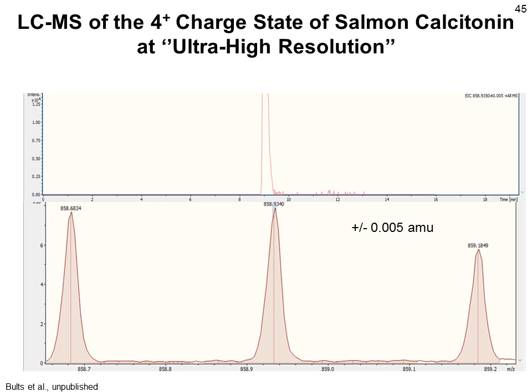This is a new way of analyzing biological samples, thanks to the availability of ultra-high mass resolution analyzers. Actually, this work was done with an ultra-high resolution time-of-flight mass analyzer, so you can see that the time-of-flight mass analyzers rival the Orbitrap mass analyzers in the latest generation.